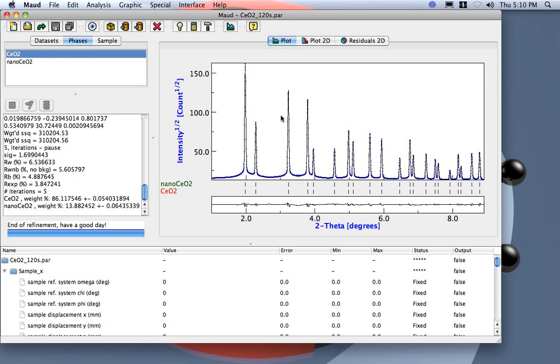We are only interested to get a good fit, a better intensity, as much as possible a good fit, because we are fitting the line broadening, so the instrumental broadening and the peak position, the calibration of the detector.